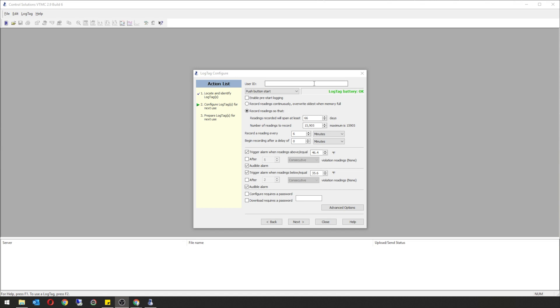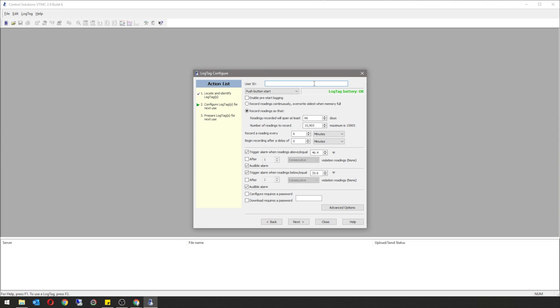Once the action list has loaded, start by giving your device a name. You're going to want to make sure that you have it on a push button start and record readings, recording a reading every six minutes — this is your sample rate. The days and number of readings is an auto population of this sample rate. You're going to want to have your trigger alarm on and your audible alarm on.